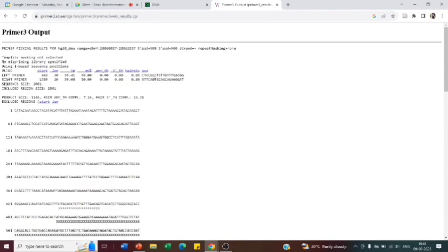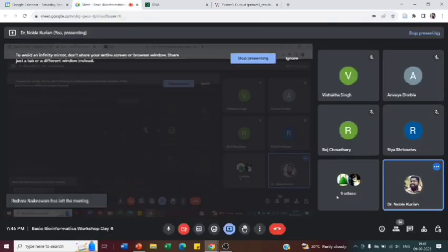Did you get it? Otherwise, you can just check the recordings. So hope you got how the primer is designed.